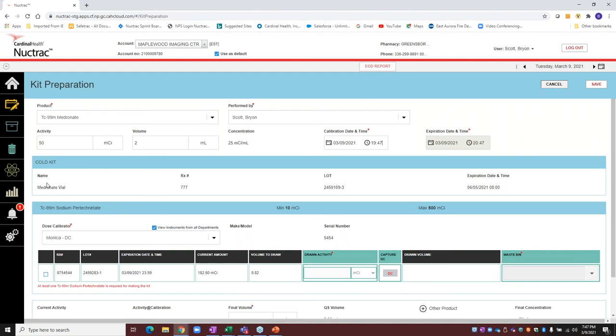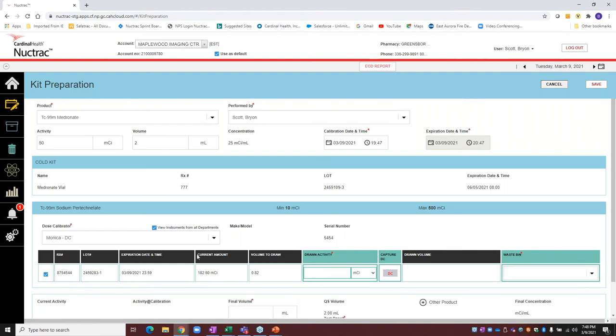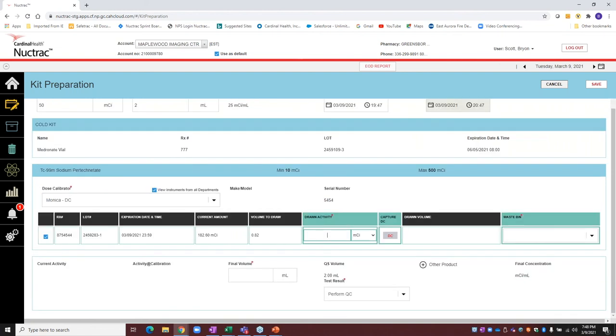Well, it is a 6-hour expiration. It's a 1 hour beyond use date. So it's going to enforce the rule for 1 hour. I cannot cheat the system here. I can't bump the system out and say, take me out longer. I want to pulse cal this so I can keep it longer. You can't. A good system shouldn't let you cheat the system.